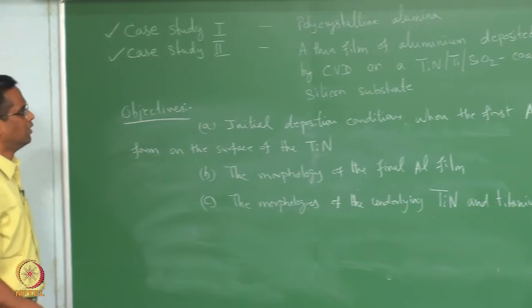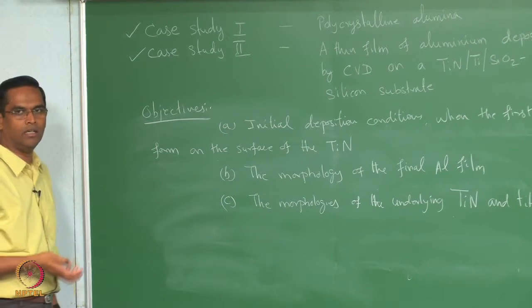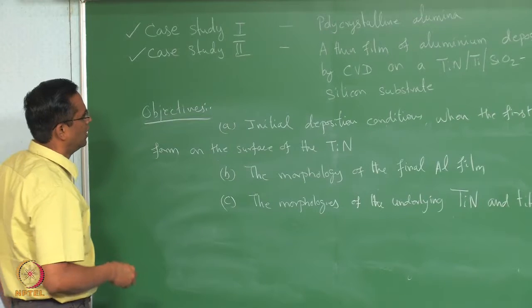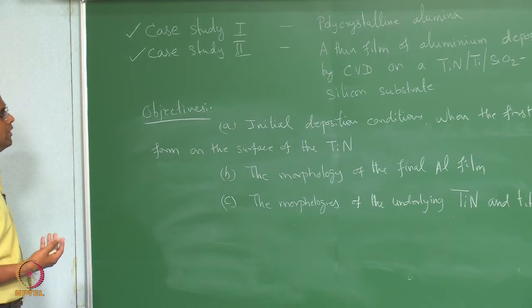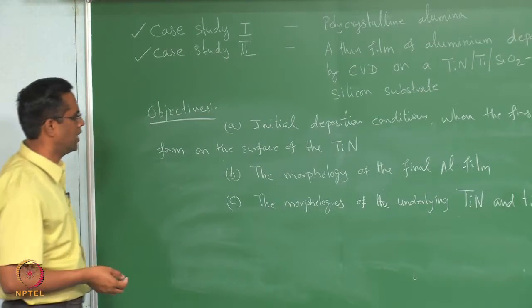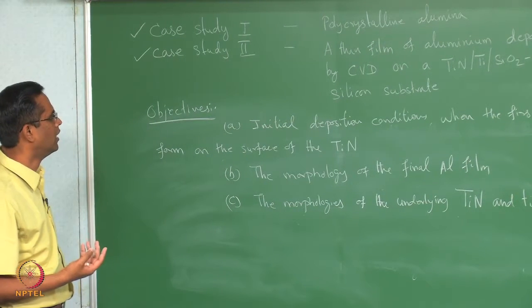So, if you look at the sample preparation, since it is a metallic sample, which is a conductor, you do not have to worry. It is very straightforward.